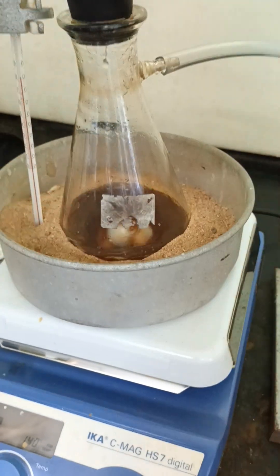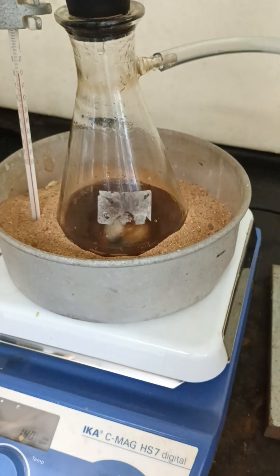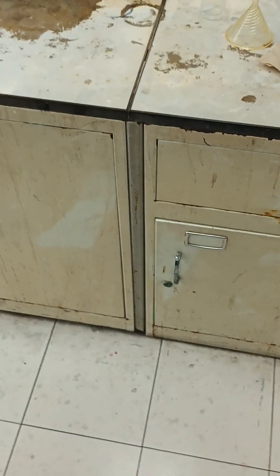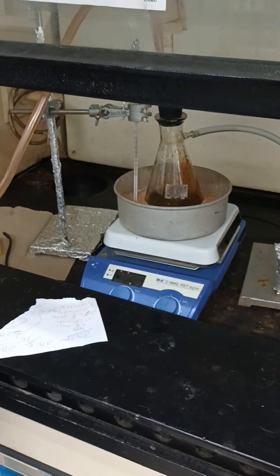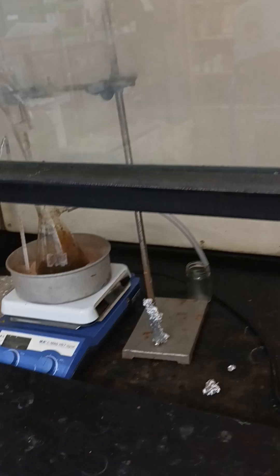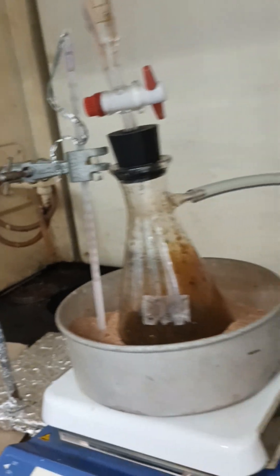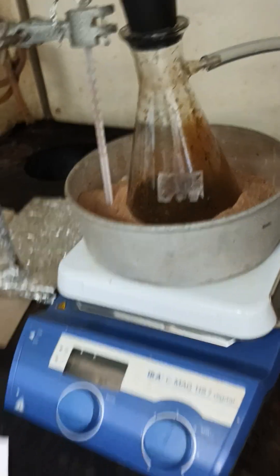This black precipitate is coming now — these are the magnetic nanoparticles. The gas is coming out!